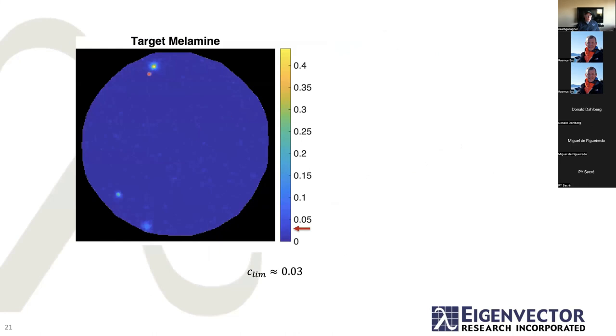Boom, I've got my big clump of melamine up here, and you can plot the spectrum, you can see it. But look at this range here. That's a big range compared to what this estimation error is. Even if I took three times that, which would be about there, you can see that my detections are really a long ways away from the bottom here at zero.